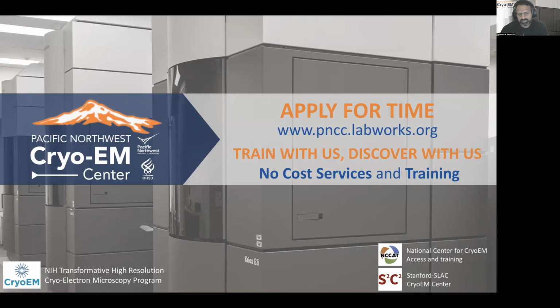The second type is called a general access proposal, which awards up to 480 hours of microscope time a year for 2 years, so a total of 960 hours. This time can be used for screening or data collection. Approved general access proposals are also eligible for our training workshops, which cover topics ranging from grid preparation all the way to data processing.